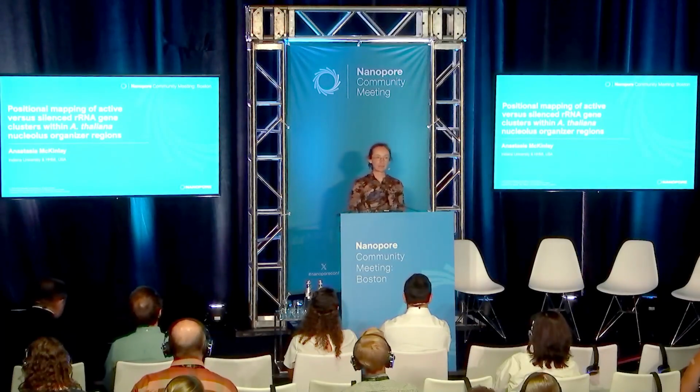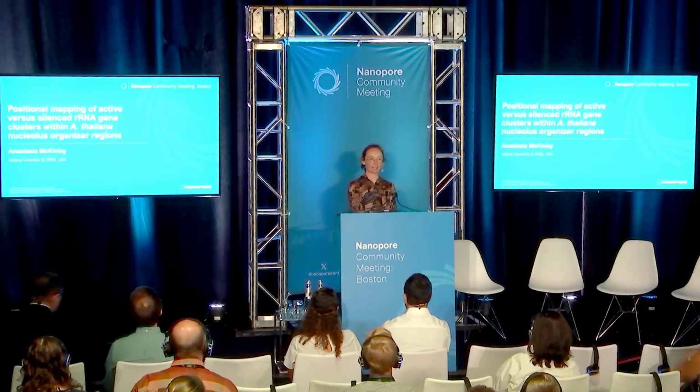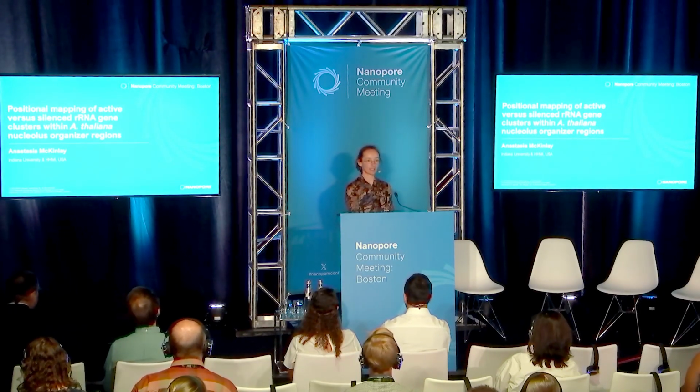Well, hello everybody. So today we'll be talking about highly repetitive ribosomal RNA gene-containing regions, also known as nucleolus organizer regions, and I will show how we study these regions using Oxford Nanopore sequencing technology and what we learned so far.